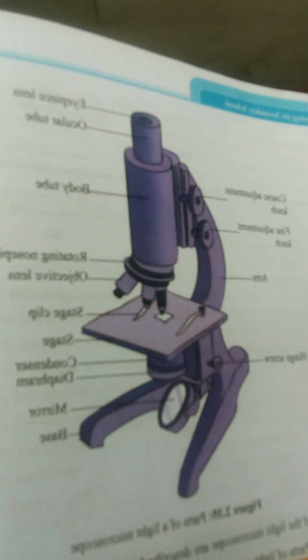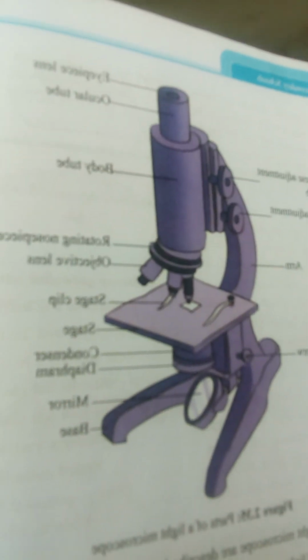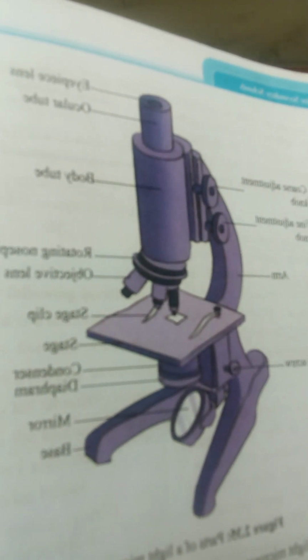This is the structure of the microscope. You can see number one is the eyepiece. From the top, ocular tube, there is a body tube, coarse adjustment knob, fine adjustment knob, and other parts of the microscope as you see.